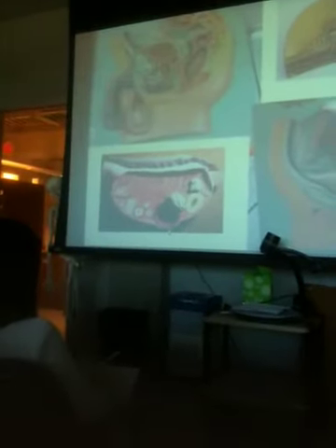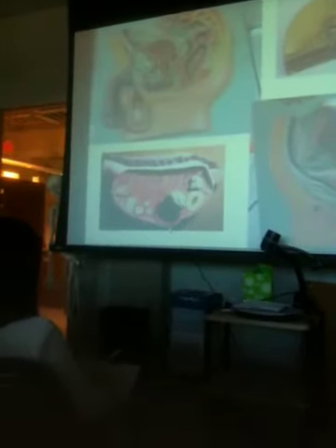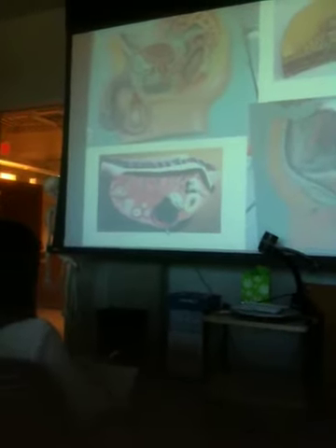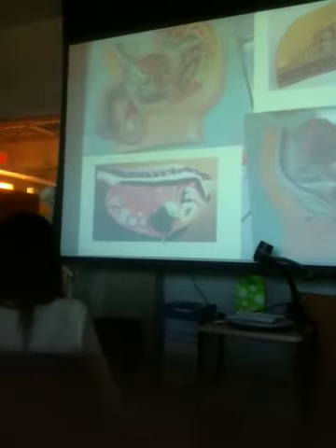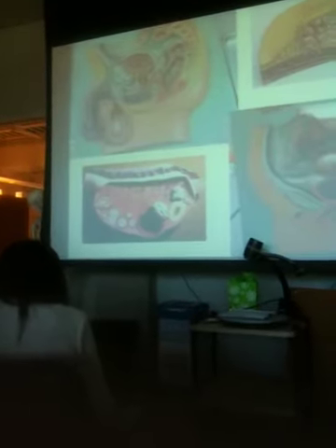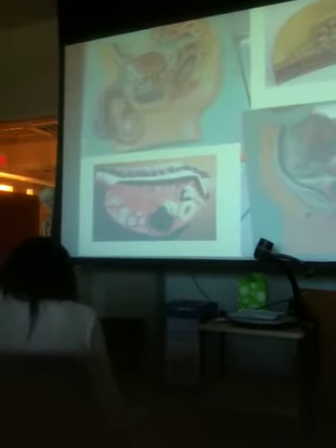Anybody come up with the name of that egg stage that's leaving? Oocyte? There is no word like that. No. Okay, guys, you don't know your reproductive physiology. This is a secondary oocyte. These are the immature follicles over here that haven't developed.